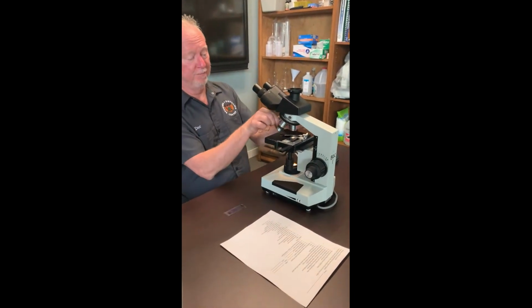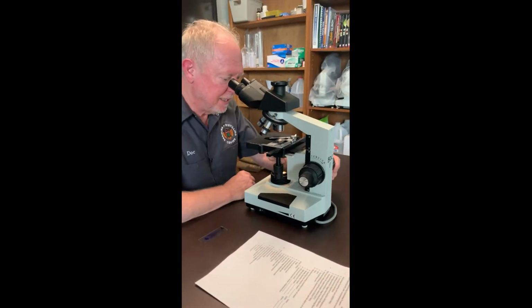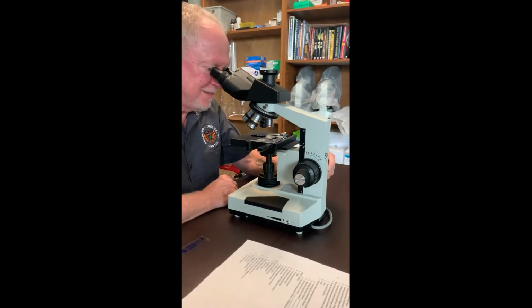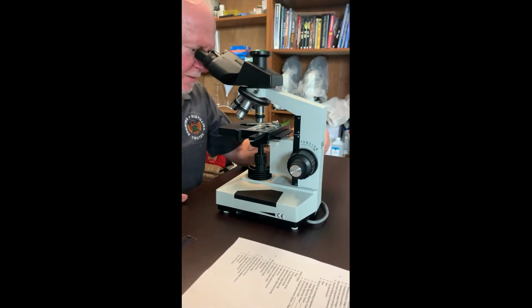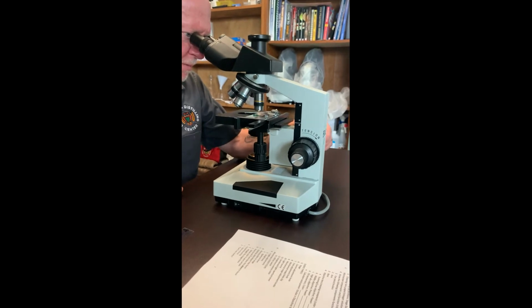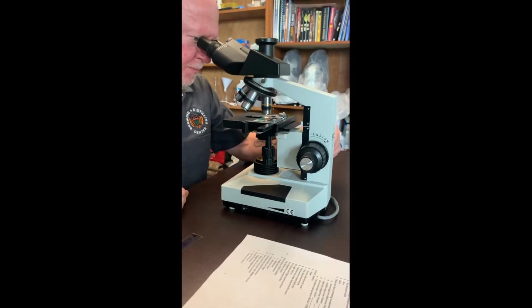I'll just go back to the lower objective that you were at previously, get it into focus again, and then try it again. Nine times out of 10, that solved my problem. Somehow I was just well past the focal point.